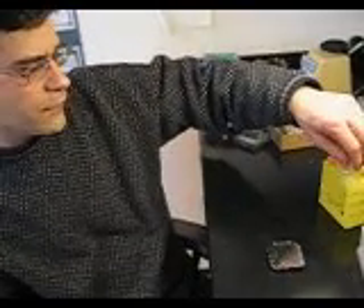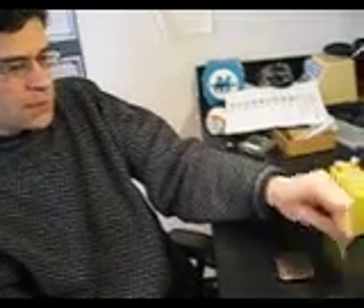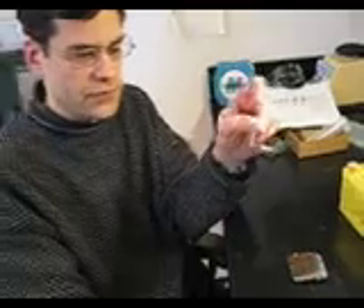We just finished preparing 5 microliters of analyte in 5 microliters of matrix in this tube. I'm just going to hit it a few times to knock the little droplet down to the bottom of the tube.